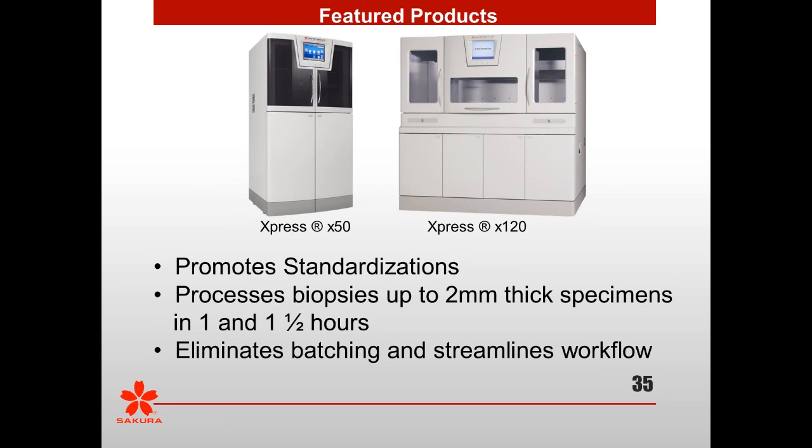Okay, thank you. The next question is, standardizing an H&E stain is something our lab is going to be looking into this year. I'm leaning towards the Symphony from Ventana. Do you have any recommendations? Well, it depends on what you're going to do to standardize. My suggestion, since you're attending this webinar, is that before you standardize your staining protocols, you'll get much better performance out of your H&E stains if you first standardize your fixation, processing, and tissue sampling. Think of it: if you have samples ranging from a biopsy to a 5 millimeter thick piece of uterus, and you're trying to standardize to that H&E stain, how difficult that's going to be.